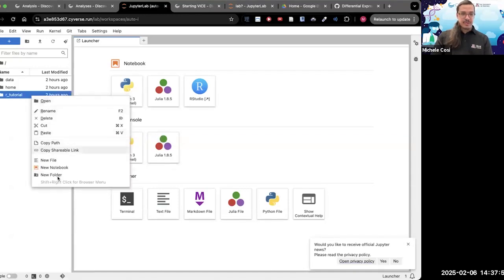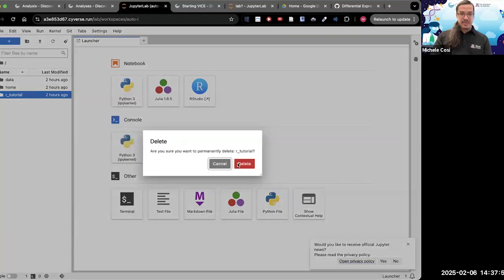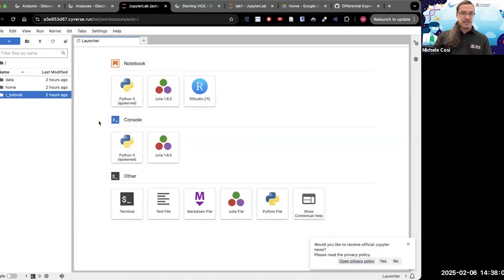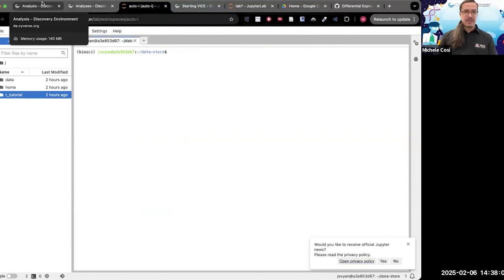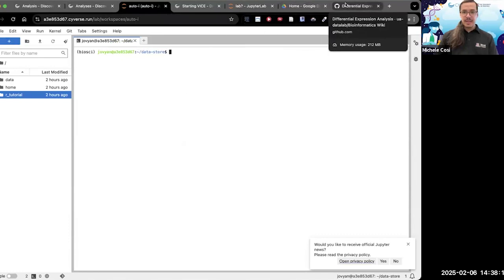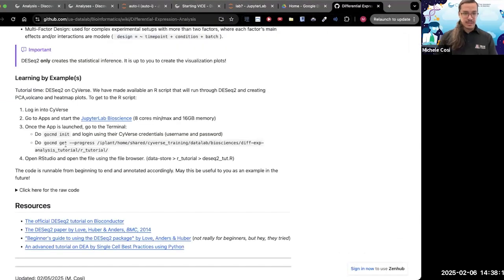Okay, I'm gonna delete the folder simply because I want to be on the same level as you folks. I don't care if it's not empty. I'm gonna load it again. I'm gonna go to my terminal, and the reason I'm going to the terminal right now is because I need to download a specific folder.